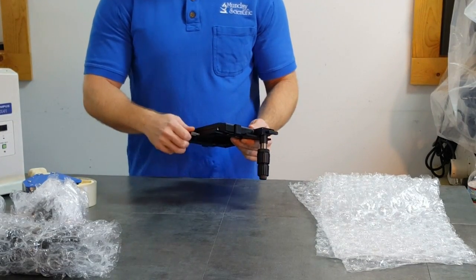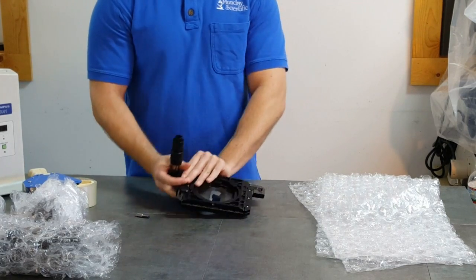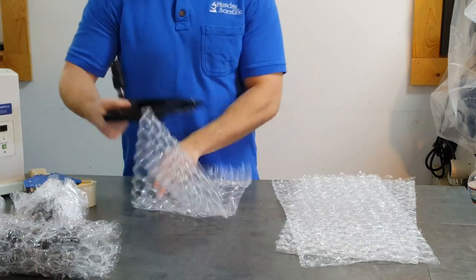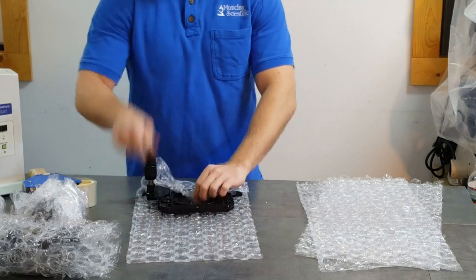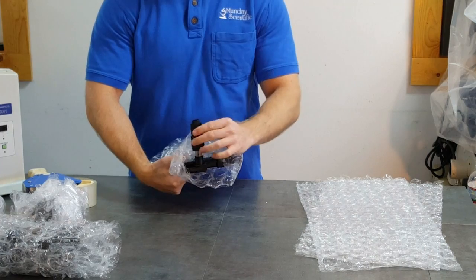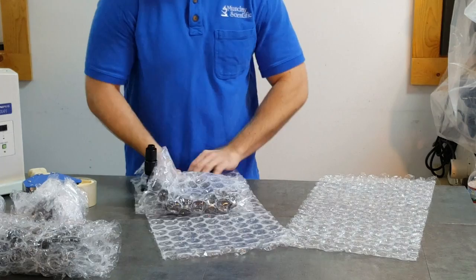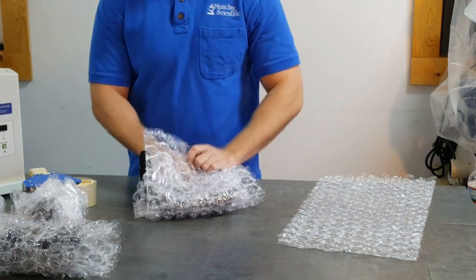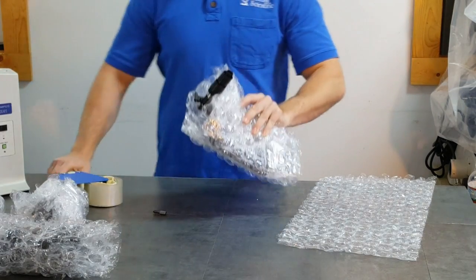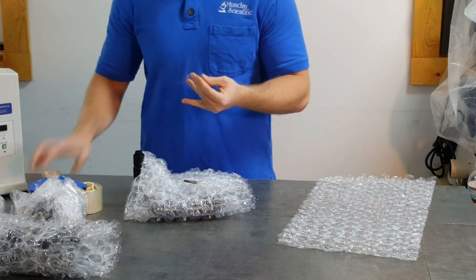The stage is also a very commonly broken item. We want to remove the stage screw before we wrap. When we double box this, we want to secure the coax drive. Take the stage screw, put it on the bubble wrap, and put a piece of tape over it so it doesn't get lost.